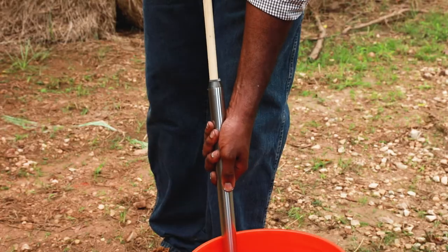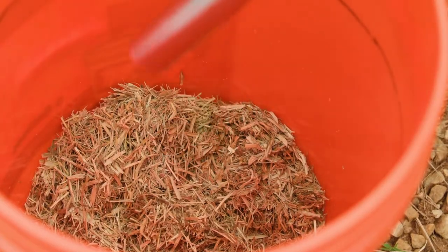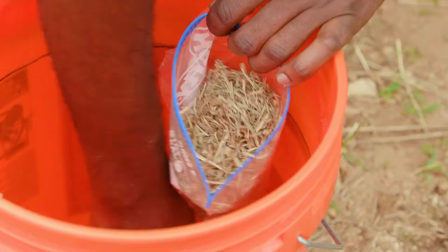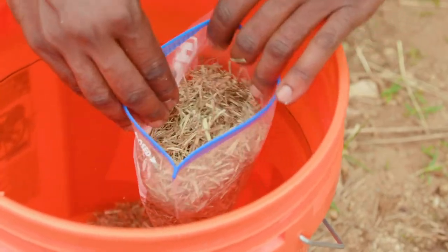Detach the probe from the drill and empty the sample into a bucket. After sampling a complete lot of 15 to 20 core samples, thoroughly mix the samples in the bucket and place a subsample in a one quart plastic bag. The bag should be at least half full.